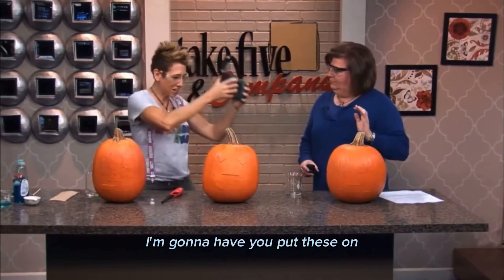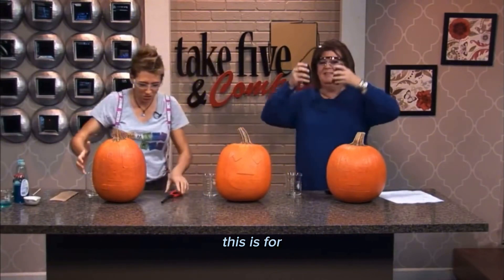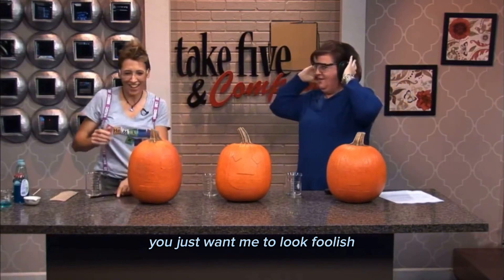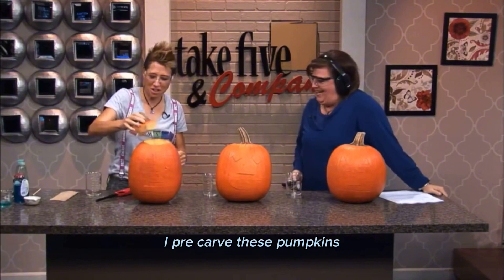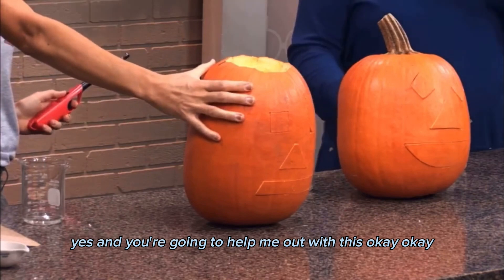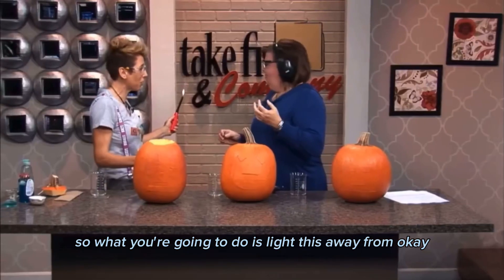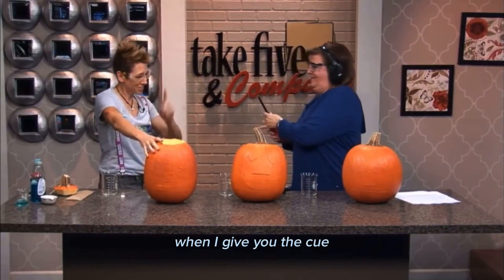Catherine, I'm going to have you put these on. Because I need them? Well, this is for beginning level chemistry. You just want me to look foolish! I can't hear a word you're saying. Now, of course, I pre-carved these pumpkins. I have the calcium carbide in here, and you're going to help me out with this. So what you're going to do is light this away from the pumpkin. I am terrified. When I give you the cue, you're going to put it right here.